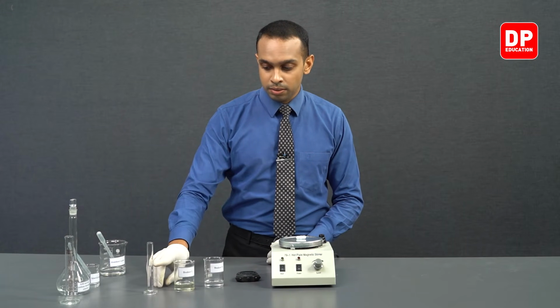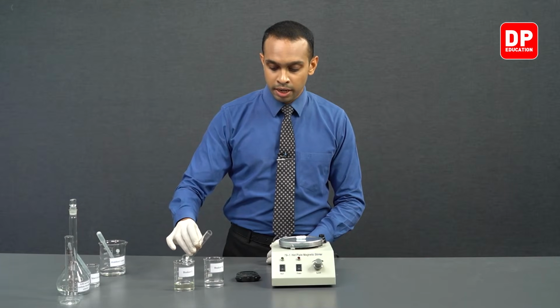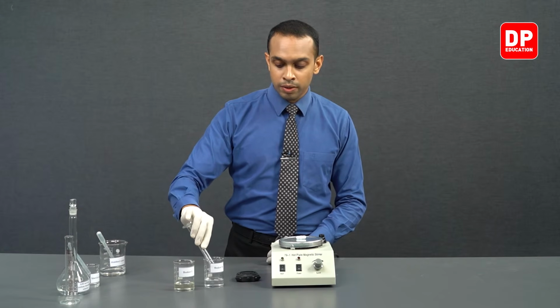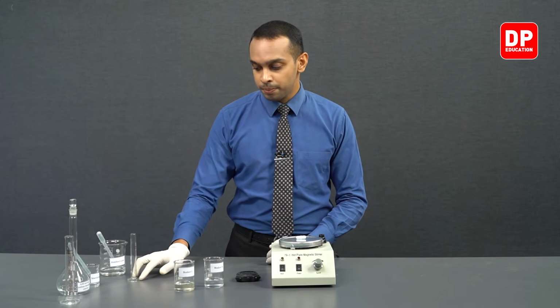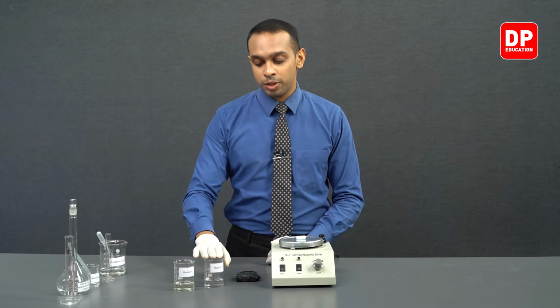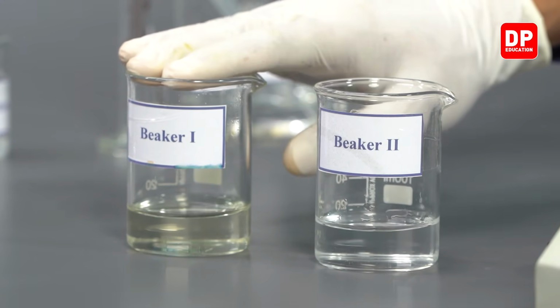We have measured 8 milliliters of distilled water, so we'll be adding this 8 milliliters of distilled water to beaker 2. So 17 milliliters plus 8 milliliters would be 25 milliliters. So we have 25 milliliters of solution in beaker 2 as well as 25 milliliters of solution in beaker 1.